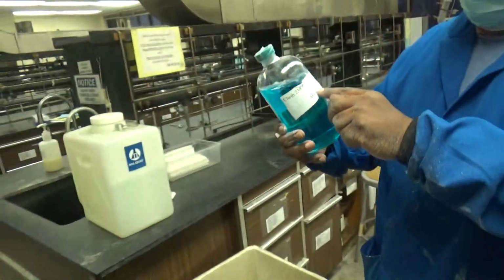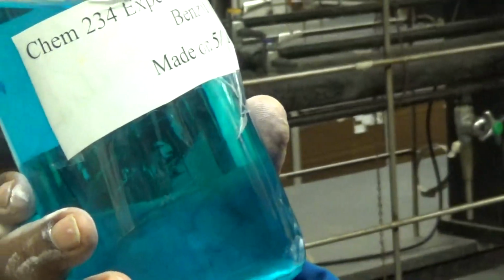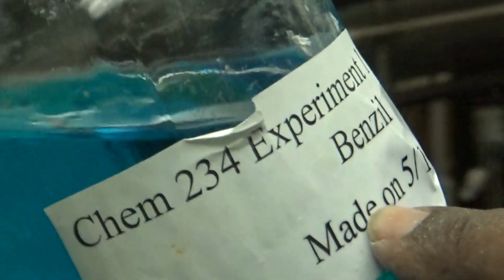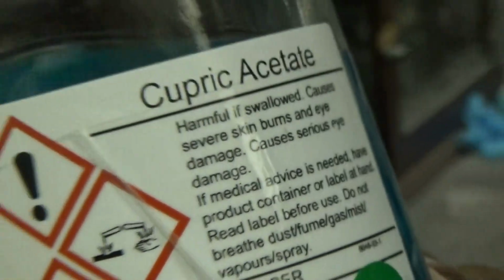The stockroom did not really label that correctly, because there should be copper acetate, cupric acetate in acetic acid. Let me see, it says somewhere on the back. Flip it around. It does say cupric acetate. It just does not say that it's acetic acid. So that's a little bit of a labeling error.